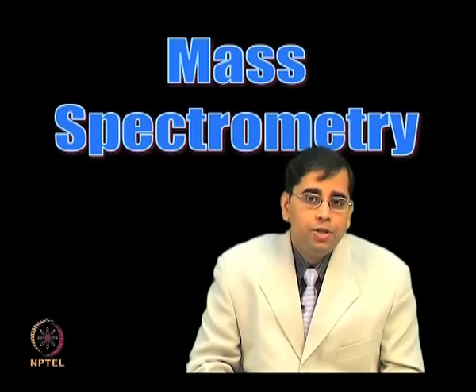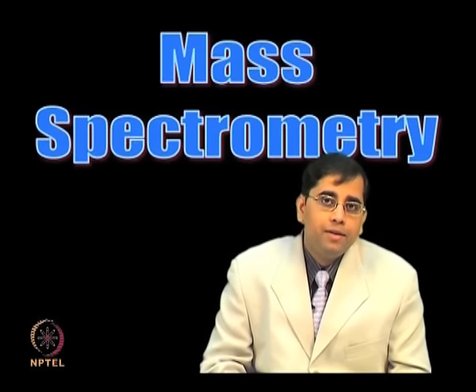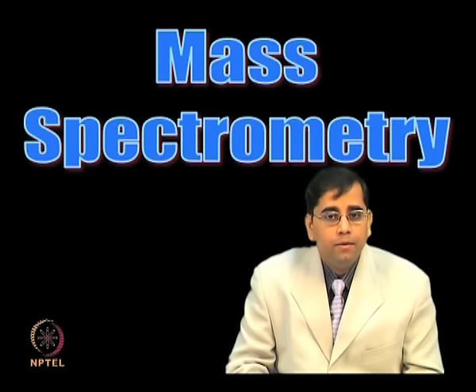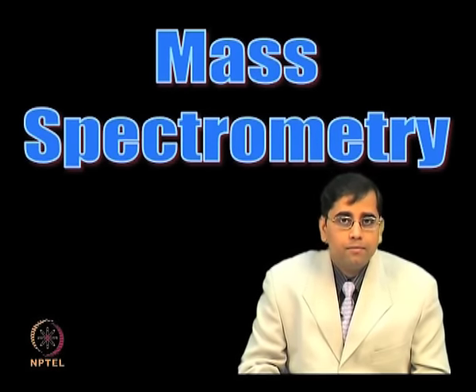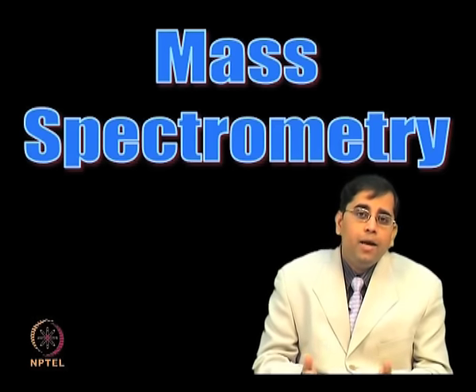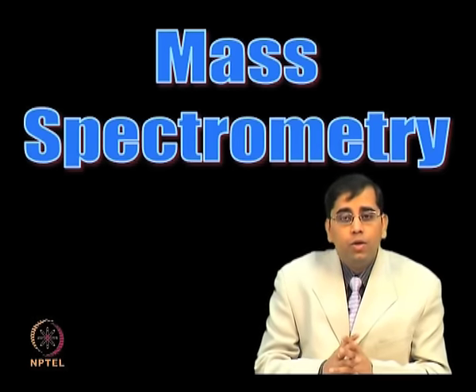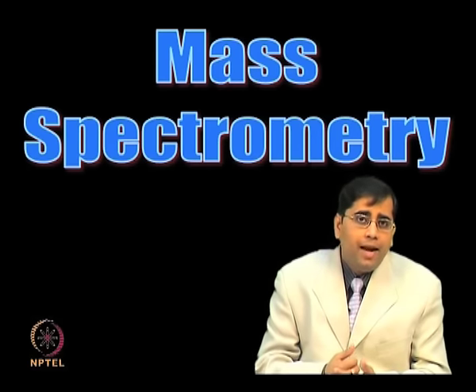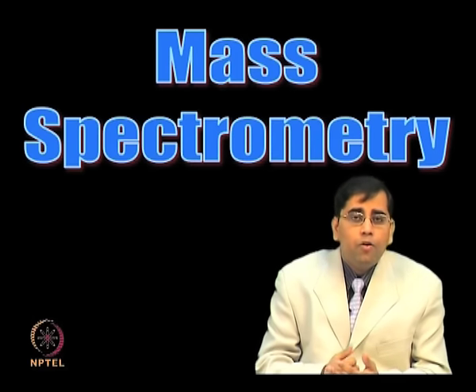To overcome such issues, mass spectrometry has become an important analytical tool in proteomics and in biology in general. It offers high throughput, sensitive and specific analysis for many applications.